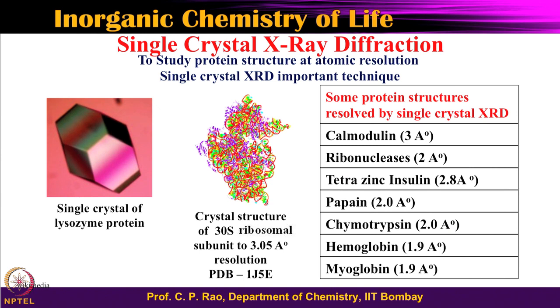Let us go to another technique. Another technique that I am trying to give you here is single crystal X-ray diffraction. For this the criterion is that the enzyme should give a good diffractable single crystal. Single crystal means the whole thing is one single piece and developed along its axes of x, y and z, so it builds up in an integrated way.